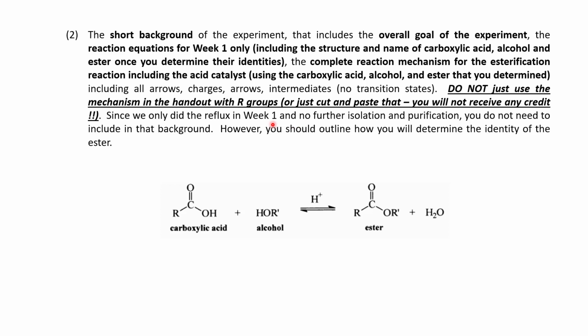And since we only did the reflux in week 1, there's normally in the background we would have how you isolated the product, how you purified it. In this case, we didn't isolate and we didn't purify the product. So you don't need to put that in your background. However, you will have to outline how we're going to determine the identity of the ester.